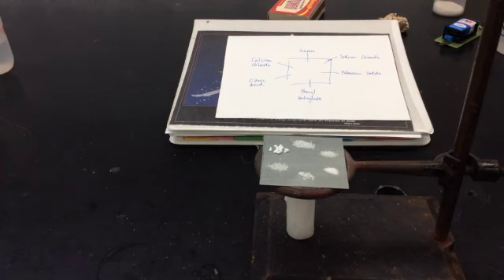All right, it's time for the melting point test. As you can see, we have all six compounds on a small piece of metal mounted on a ring stand with a candle underneath. Each of the six compounds is white, and with the exception of the calcium chloride, they're all crystalline. One thing to note with calcium chloride, probably doesn't show up on the video, but it looks almost as if it's wet, and that's because it is.